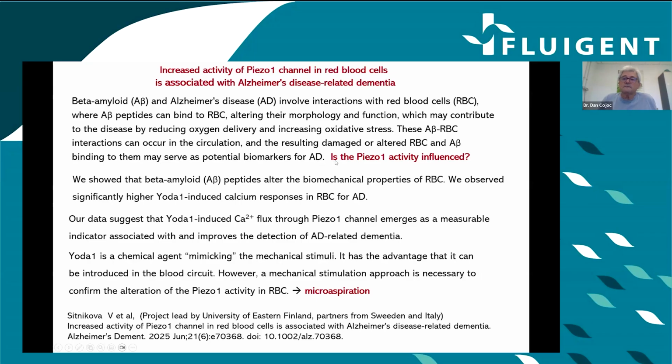So the question we address is: is Piezo1 activity influenced? We showed that beta amyloid peptides alter the biomechanical properties of red blood cells, and we also observed significantly higher Yoda1-induced calcium responses in red blood cells for Alzheimer's disease.